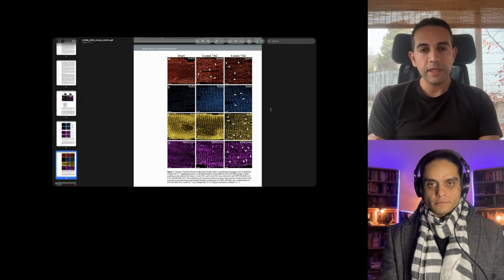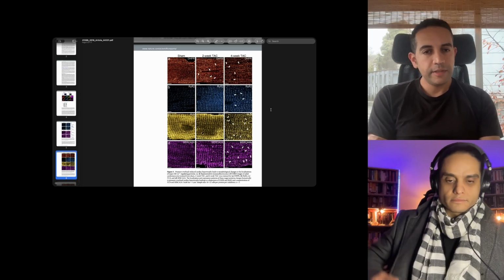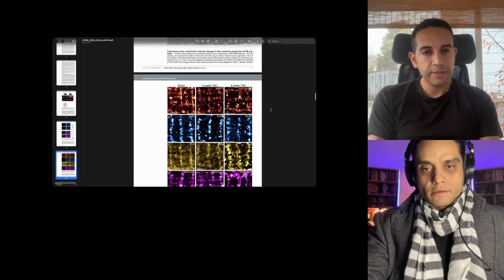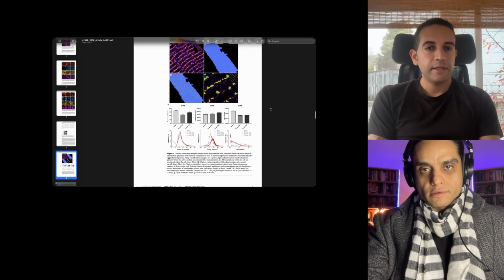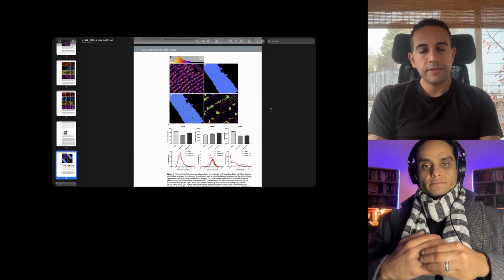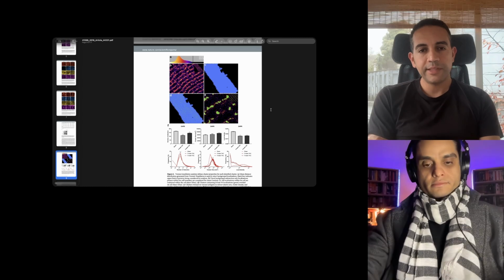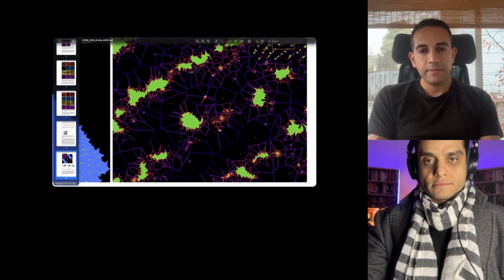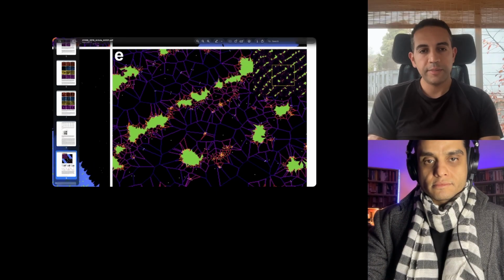And so then what we did was, if you go down, Tarek, there's I think a figure that shows this clustering I'm talking about. Yeah, so you can see that you segment out the cell, and then in green you're capturing now these clusters using the clustering algorithm that I was talking about.